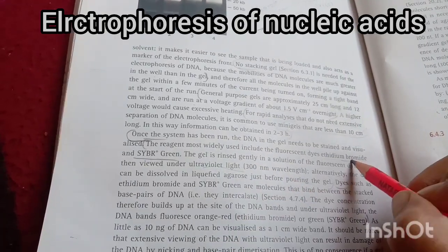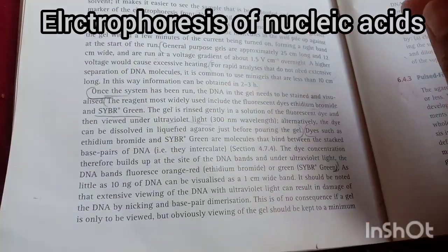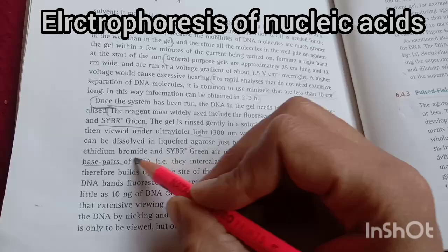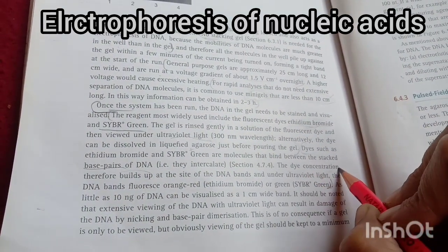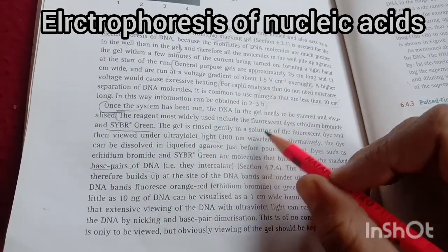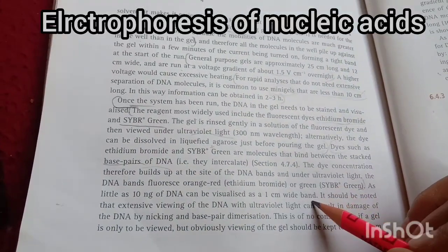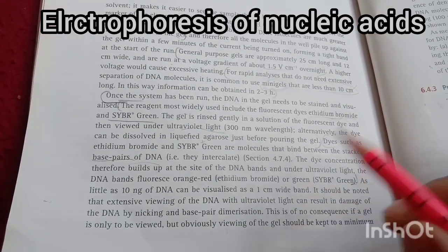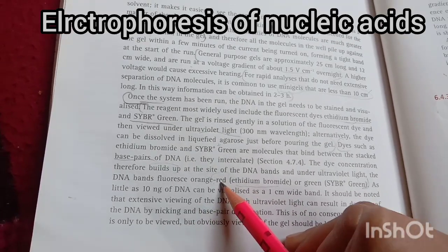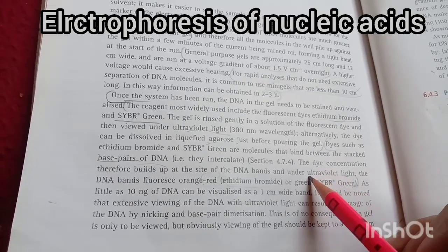Dyes such as ethidium bromide and SYBR Green bind with the stacked base pairs of DNA, okay? The dye concentration therefore builds up at the site of the DNA bands. We can see the bands here, so we can visualize them. For example, ethidium bromide gives an orange-red color, and SYBR Green, as the name suggests, gives a green color.